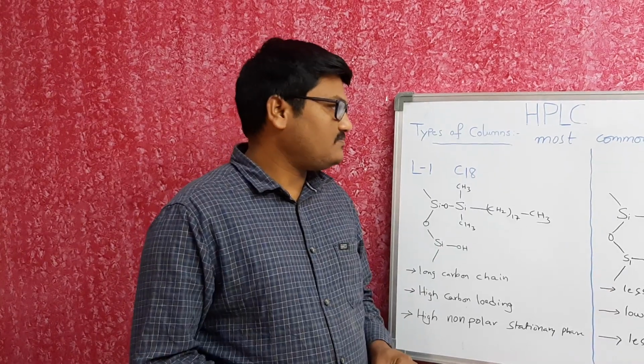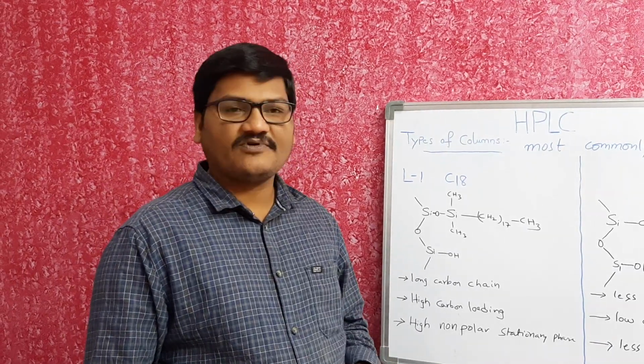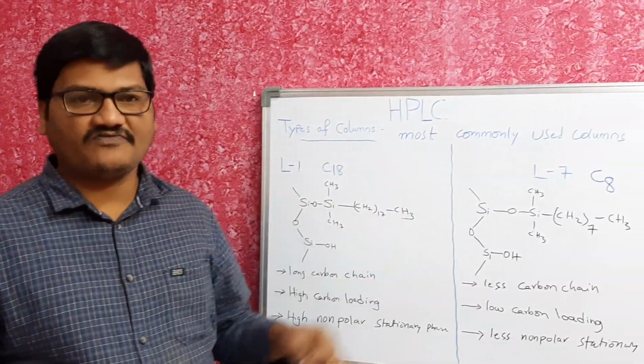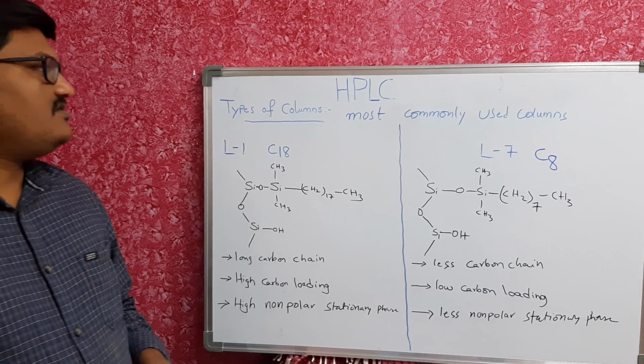Last video lo manam types of detectors which are used in HPLC గురించి డిస్కషన్ చేసాం. ఈ రోజు మన టాపిక్ వచ్చేసి types of columns used in high pressure liquid chromatography. Types of columns used in HPLC.